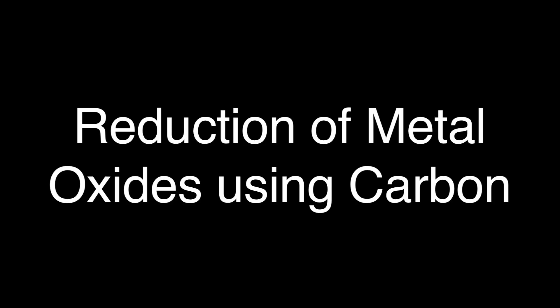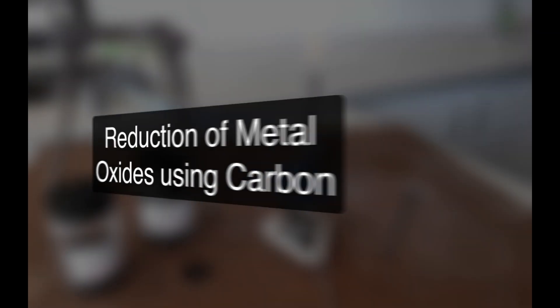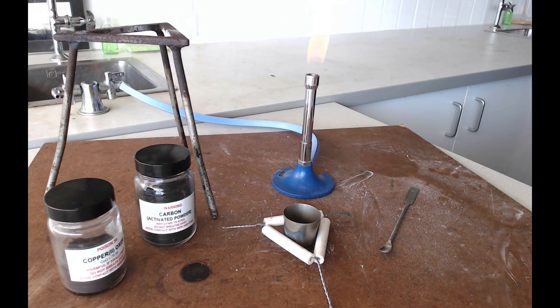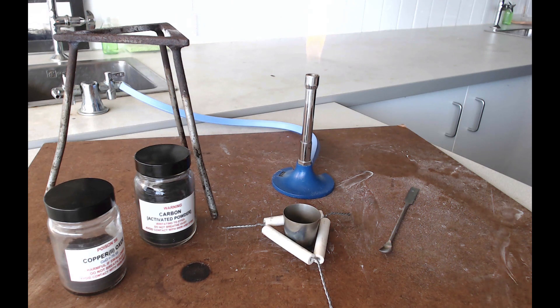Hello and welcome to this film which is all about the reduction of metal oxides using carbon. Now for this experiment, which is quite a dangerous one if you don't take care with it, there's a few safety points to watch out for here.